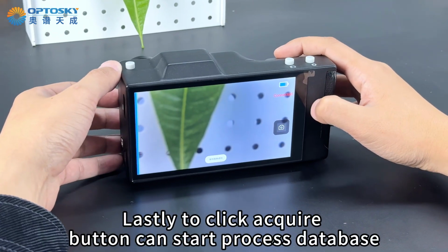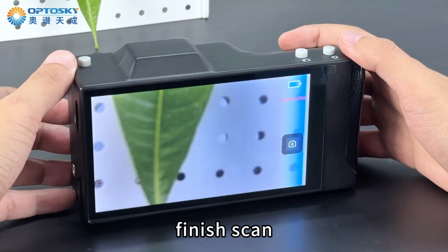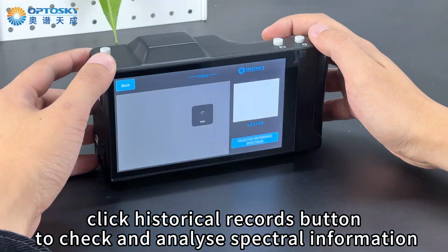Lastly, click the acquire button to start processing the database. Wait a second to finish the scan. After the scan ends, click the historical records button to check and analyze spectral information.